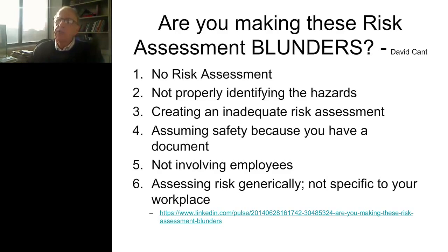So the Sentinel lab protocols put forth by ASM are still in place, and you still need to take all those same precautions, like using a biosafety cabinet to do the gram stain on a suspected Francisella tularensis. So your processes still have to account for those risks. When you get a MALDI-TOF, you should consider your processes and do a risk assessment for that instrument before you put it to work in your laboratory.